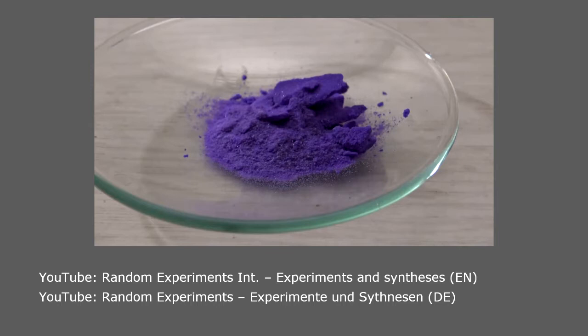I had seen a few videos on YouTube, including the one referenced here, showing how to prepare hexamine nickel chloride. It seemed pretty straightforward and had a nice look to it, being this lavender purple color.